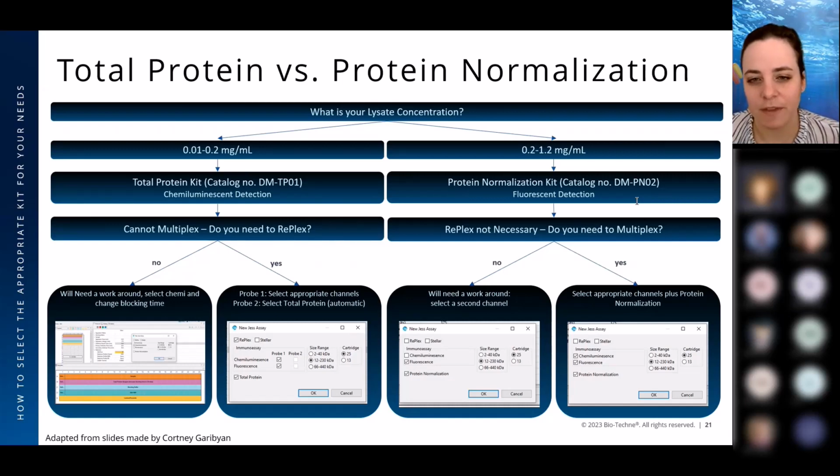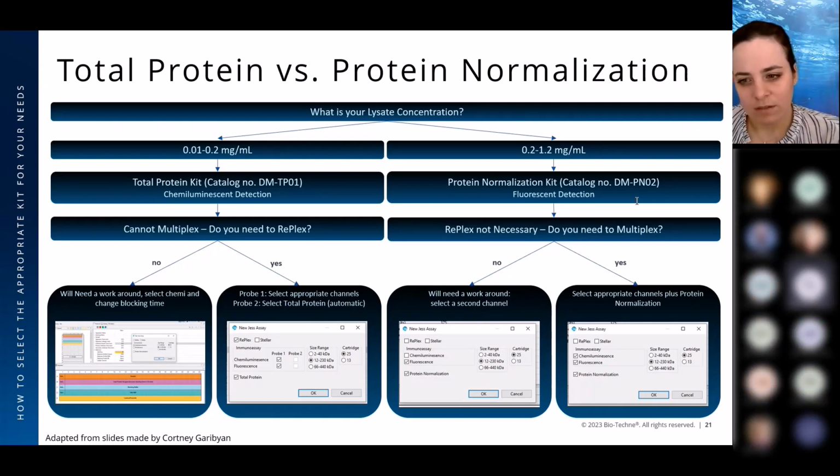I'm not quite sure on that. I might have to look at the file. Does anybody have any insights on that? So if I may, I'm still not quite understanding the situation. You're seeing on two different samples. Yeah, so with some of our targets, we see the protein normalization peaks similar right next to our target peaks, when you overlay.